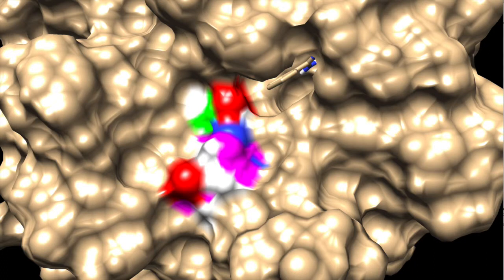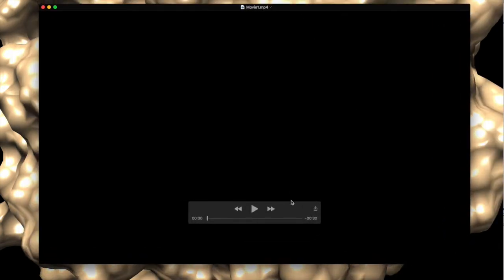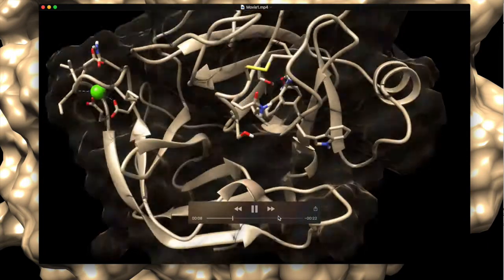Okay, when encoding finishes, you see that the movie was successfully saved here, and now we're ready to view it. So let me click on it and open it. Oh, there you go. Because of the large screen resolution here, I would have to minimize the window a little bit so it fits in here. Okay, so let's see how the movie plays now. You can also edit it additionally in some other software. Looks good.